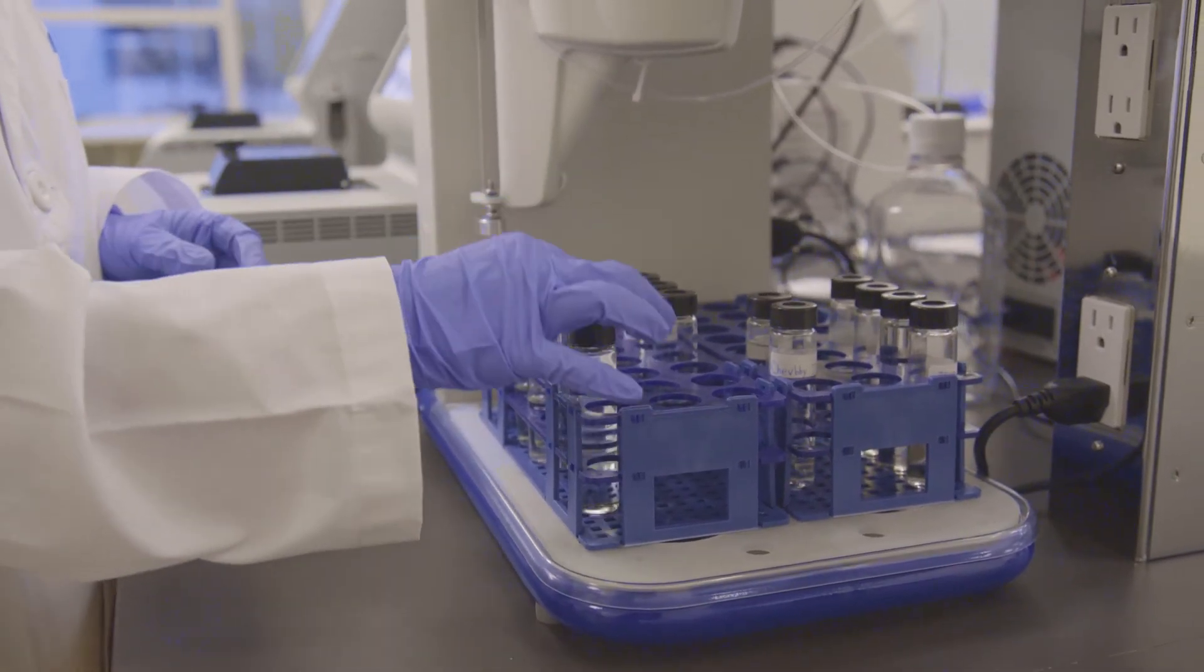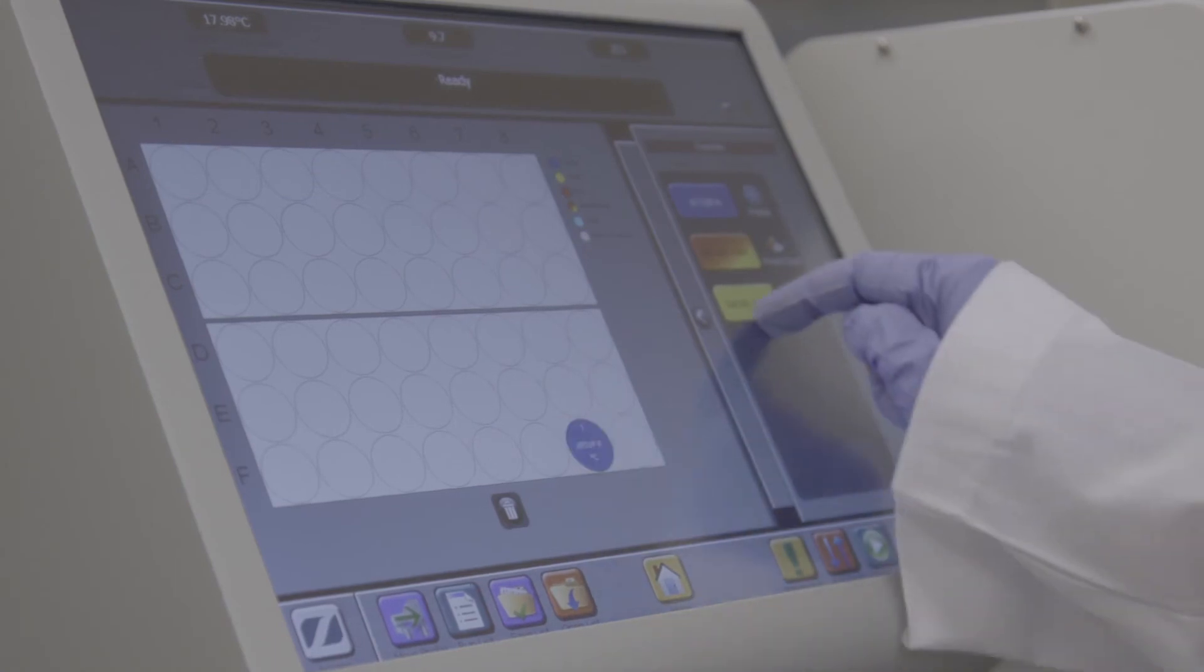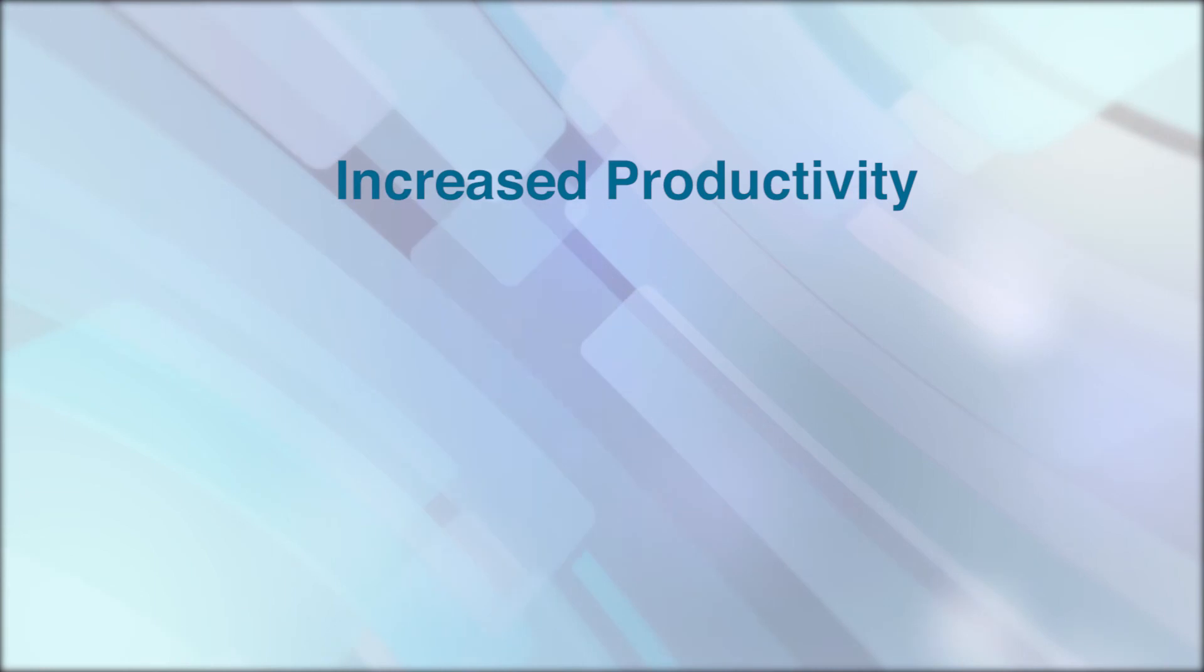Thanks to its time-saving and productivity-boosting features, the JFA 70XI can increase your lab's throughput further with a 48-place auto sampler.